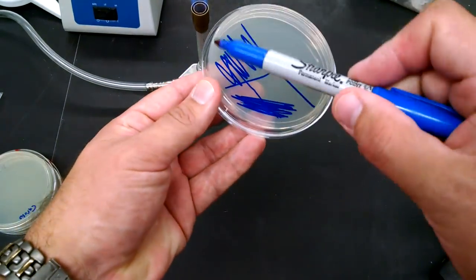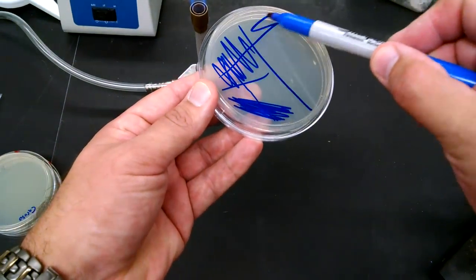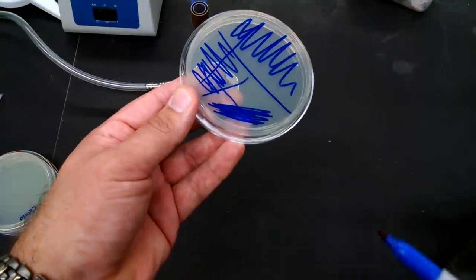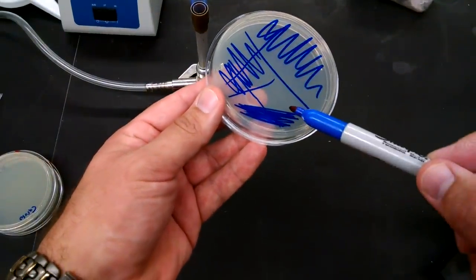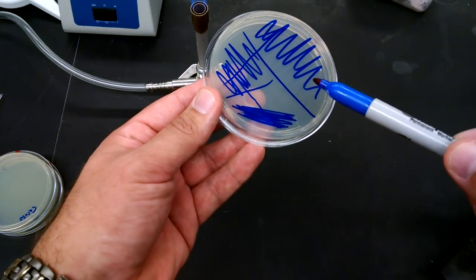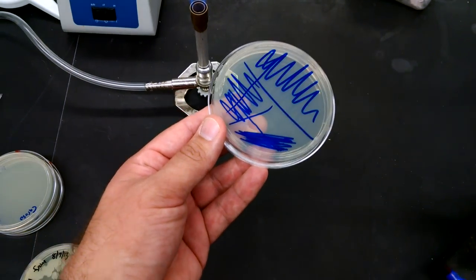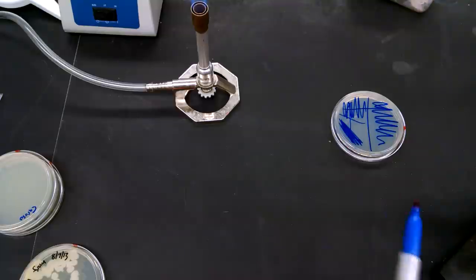Then you're going to do the same thing. You're going to drag through here one time and then spread it out. And so what we've done is we've diluted the sample on the plate. Very simple, right? And so let's see what that looks like in real life.